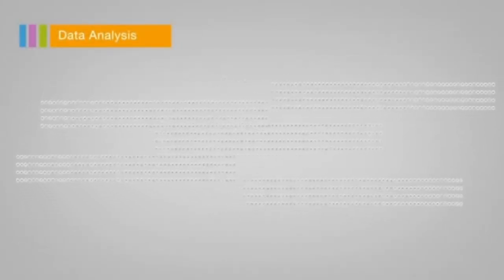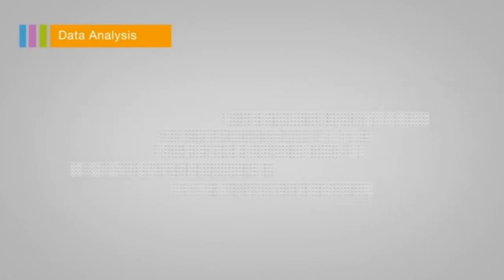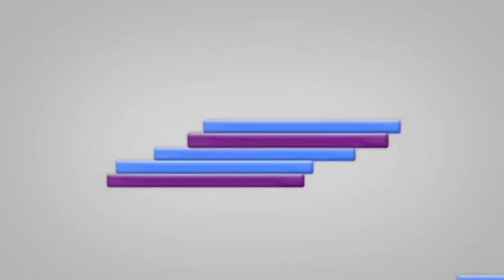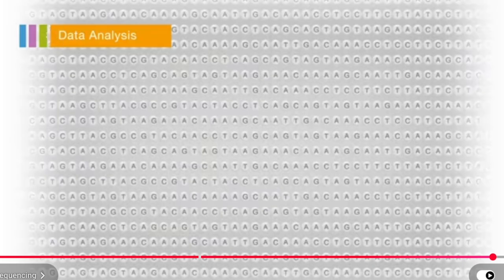So here's the main point: how you determine gene expression levels between different treatments or between different cells or between different conditions. What happens is, depending on the number of reads that map to a specific gene, you then determine the expression of that specific gene in a sample and compare it between different samples.